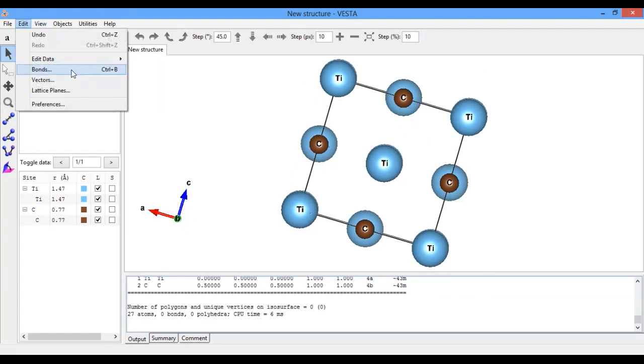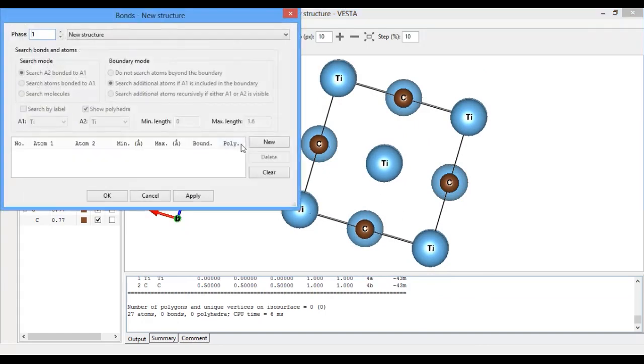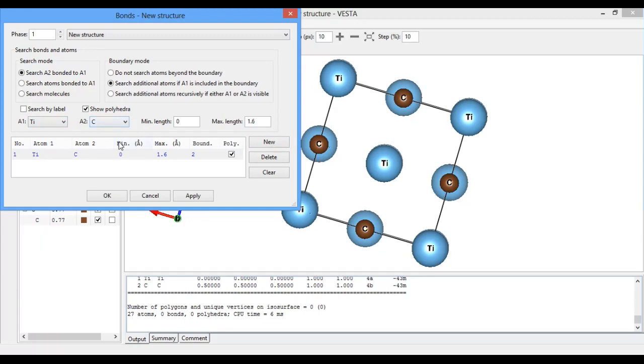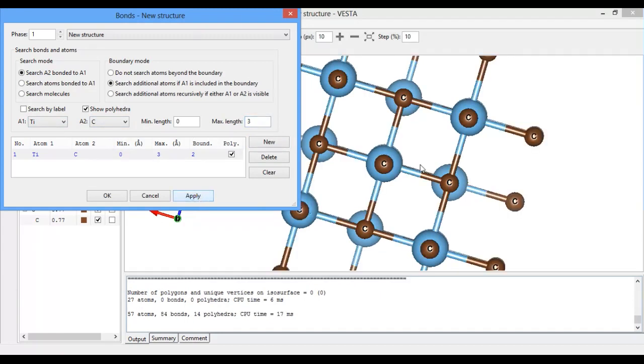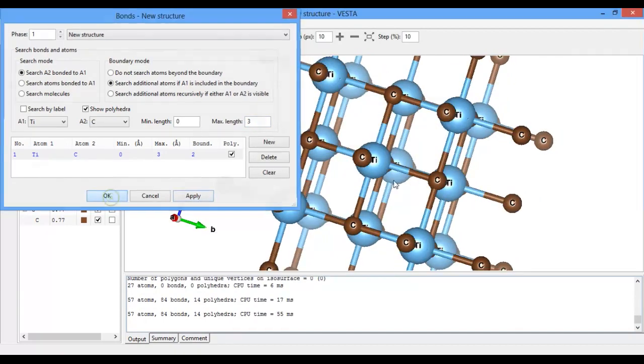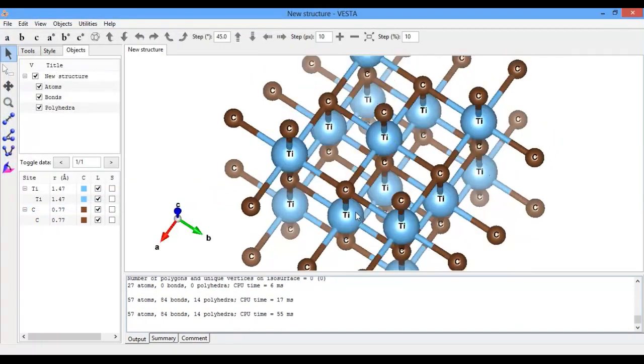Now if you want to display the bonds, go to Bonds, click on New. The bond will be from titanium to carbon, and the maximum bond length I will apply as 3. Here you see the bonds are updated.